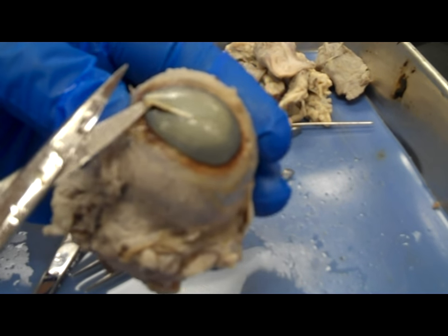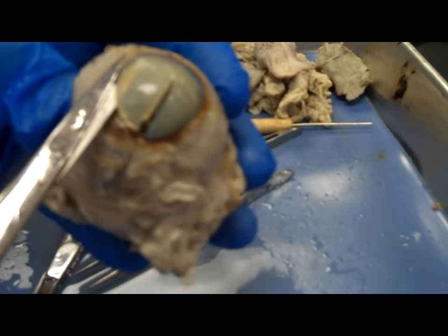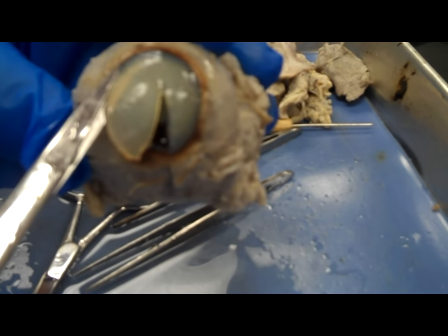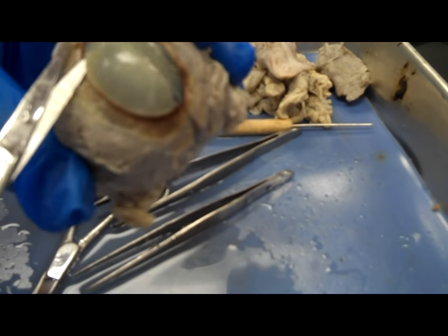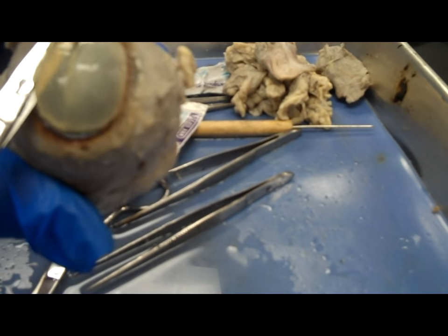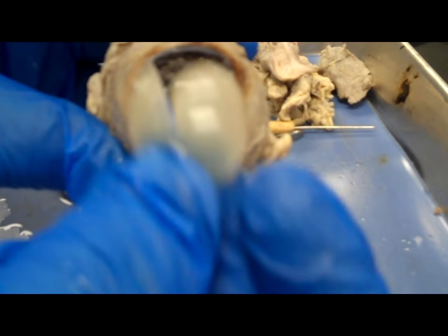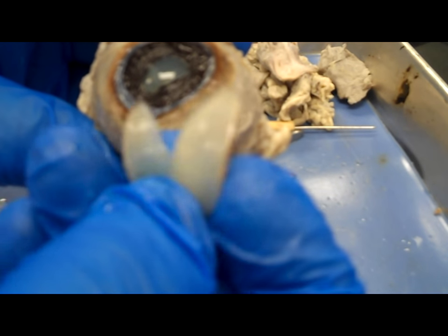Now I'm going to cut out the cornea. I'm just going to make a cut around to actually remove the cornea in this section. The cornea is much thicker than I anticipated — you can kind of see the thickness at this point.